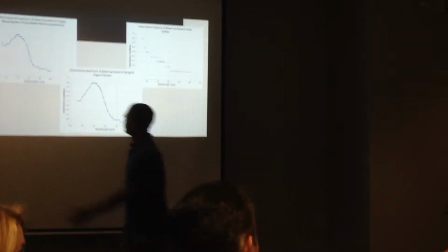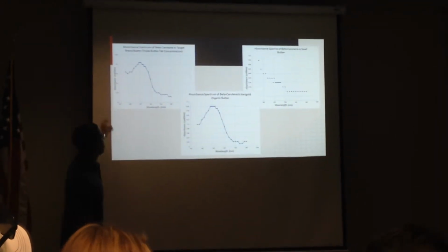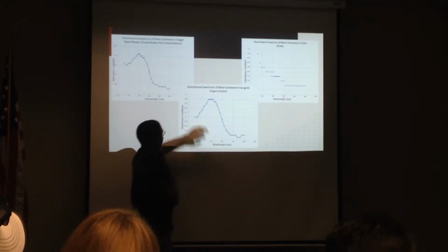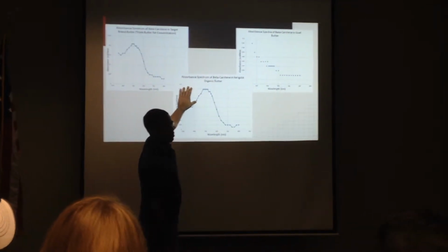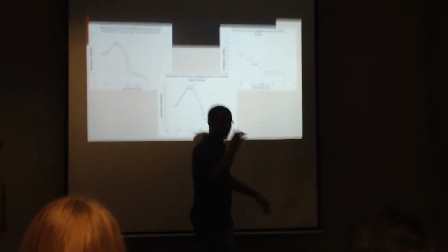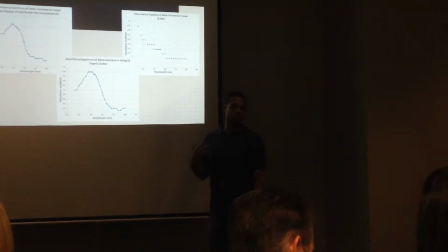You see we dissolved different butters in acetone to get the absorption spectrum. Since we have a similar curve to the beta carotene in acetone for both the target brand, this is the organic grass-fed butter, that peak absorbs in the same place and the curve is similar. So that helps us see that the beta carotene is what's doing the absorbance, given the color.